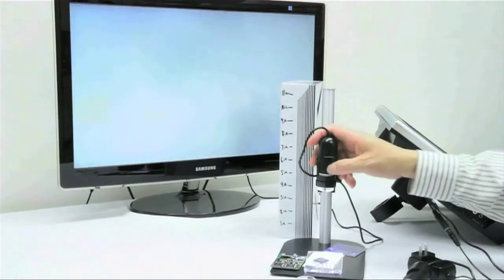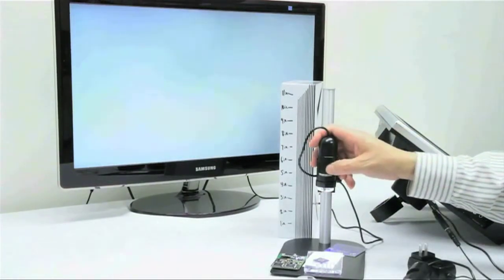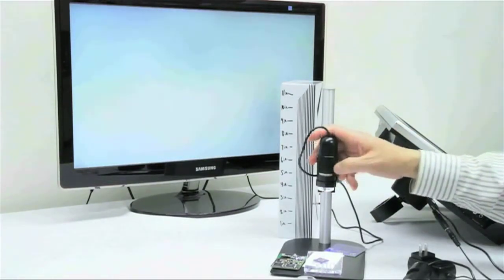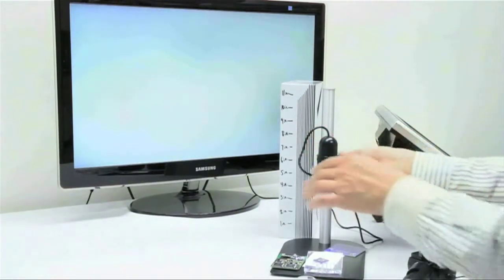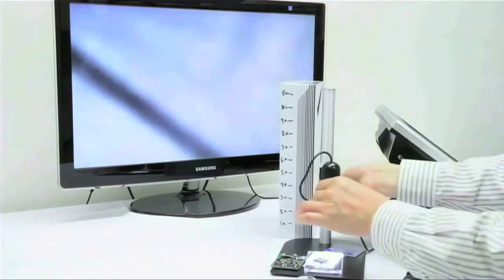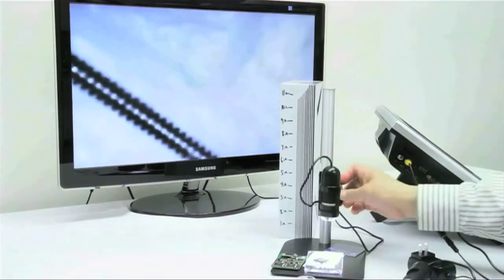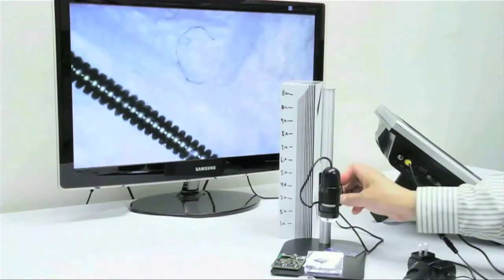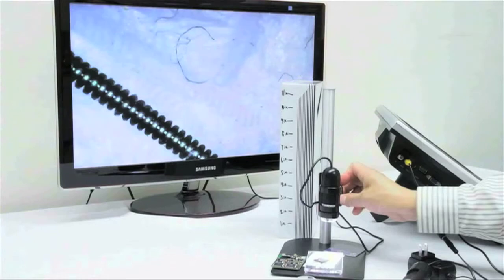In order to zoom in, we will just place the scope closer to the object. 70 to 80 to 90 times the magnification is possible.